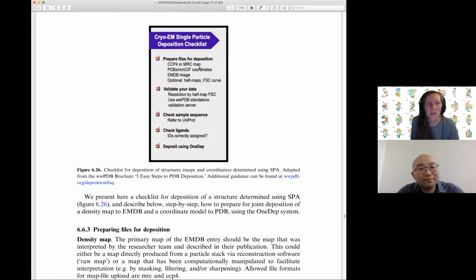So to prepare for a single particle deposition, you want to have a CCP4 MRC map, your coordinates, preferably in PDBx/mmCIF format. If you watched my lecture, I think I covered that last year. The difference, if somebody has a question, you can ask about that.